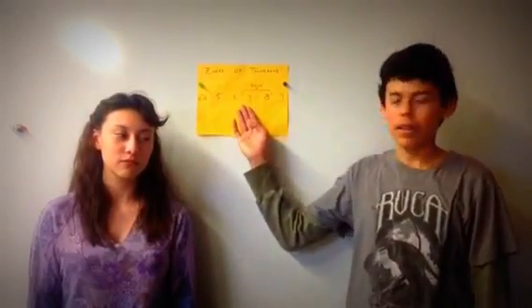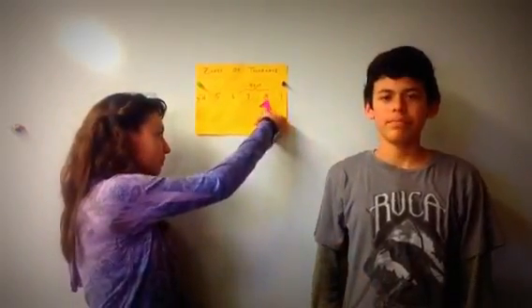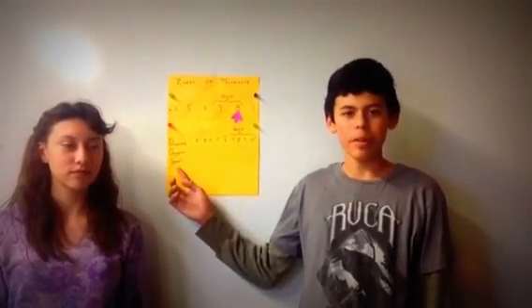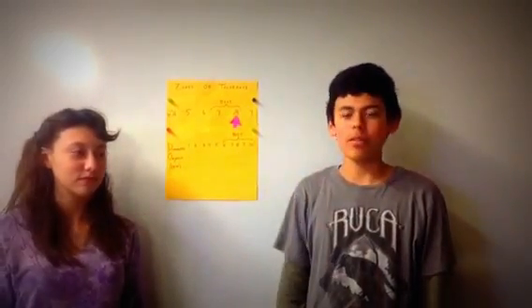Now we are going to look at our data and see how it fits in our zones of tolerance. Considering pH, the optimal levels are between 6.5 and 8.2. Ours were about 8. We also looked at dissolved oxygen, which is measured in ppm, which stands for parts per million. The optimal levels for dissolved oxygen are between 6 and 10. Ours were about 6.2.